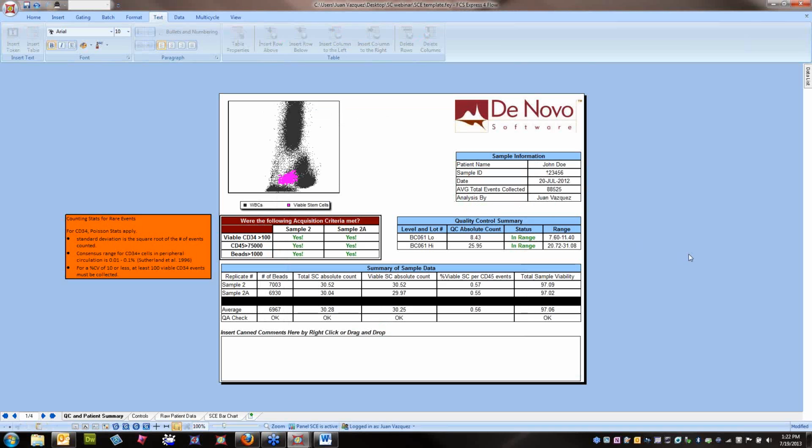If you're not familiar with keywords, you'd be surprised at the amount of keywords that are available within your data in the FCS file header. A lot of these keywords are going to be specific to the type of software and instrumentation that you're using. If you need help with keywords, just let us know. We'd be happy to help you with that.